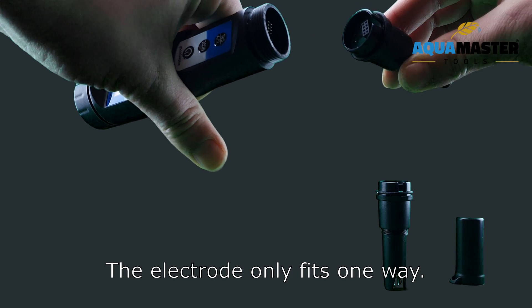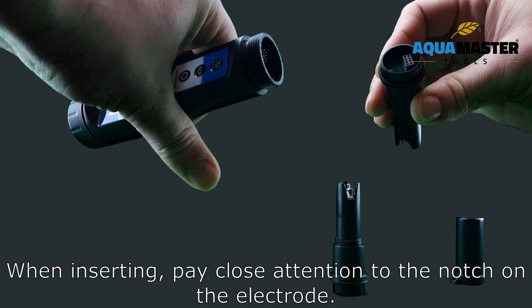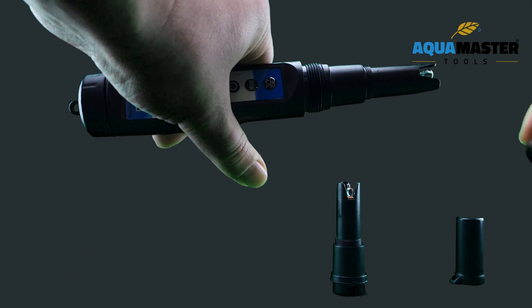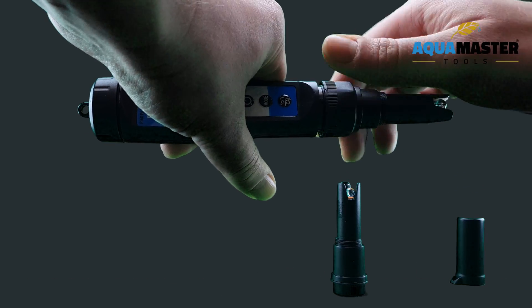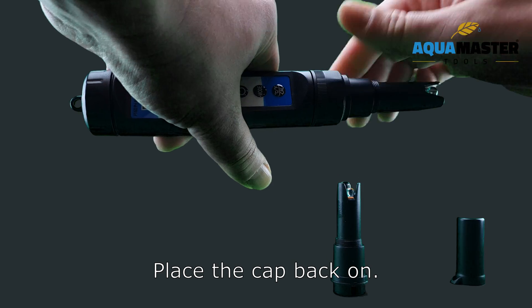The electrode only fits one way. When inserting, pay close attention to the notch on the electrode. Put the sealing ring back in place and tighten it securely. Place the cap back on.